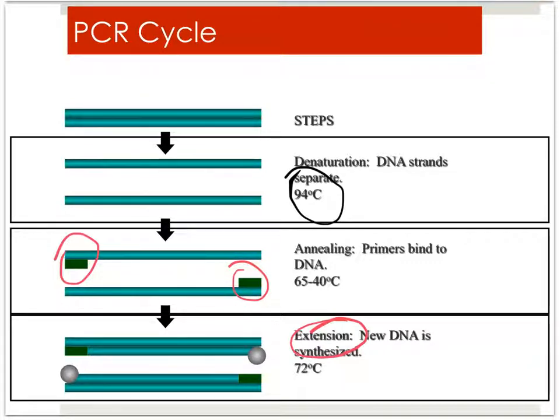What is the annealing temperature? And then we'll look at that. What is the temperature for annealing? 50, 60, it depends. Okay, we'll address that. It depends, okay? It depends. If you saw a very nice article in Science last week which used 58, you don't just adopt it for your study.